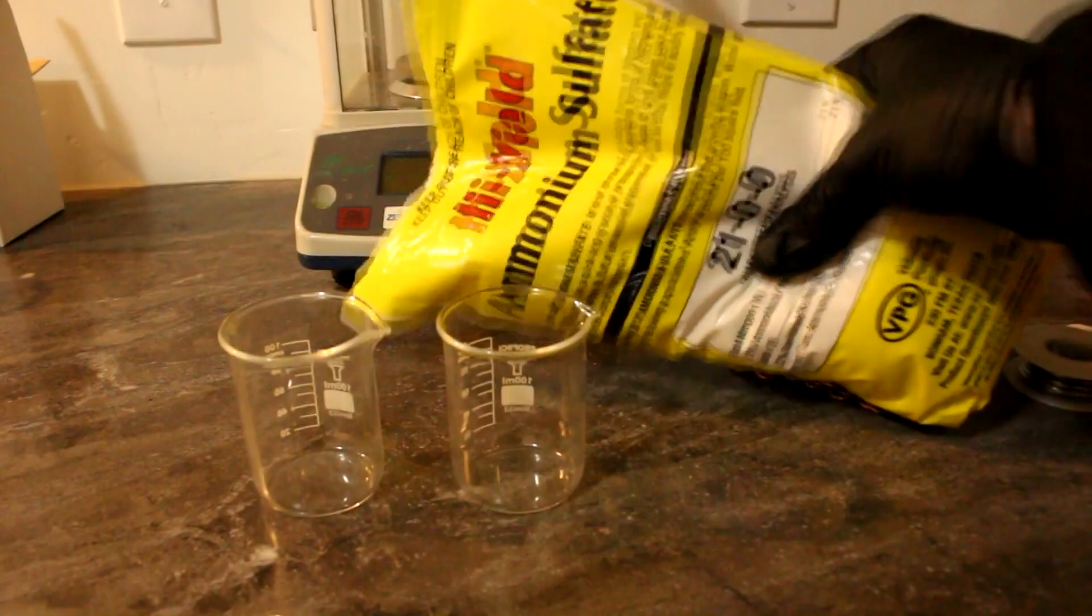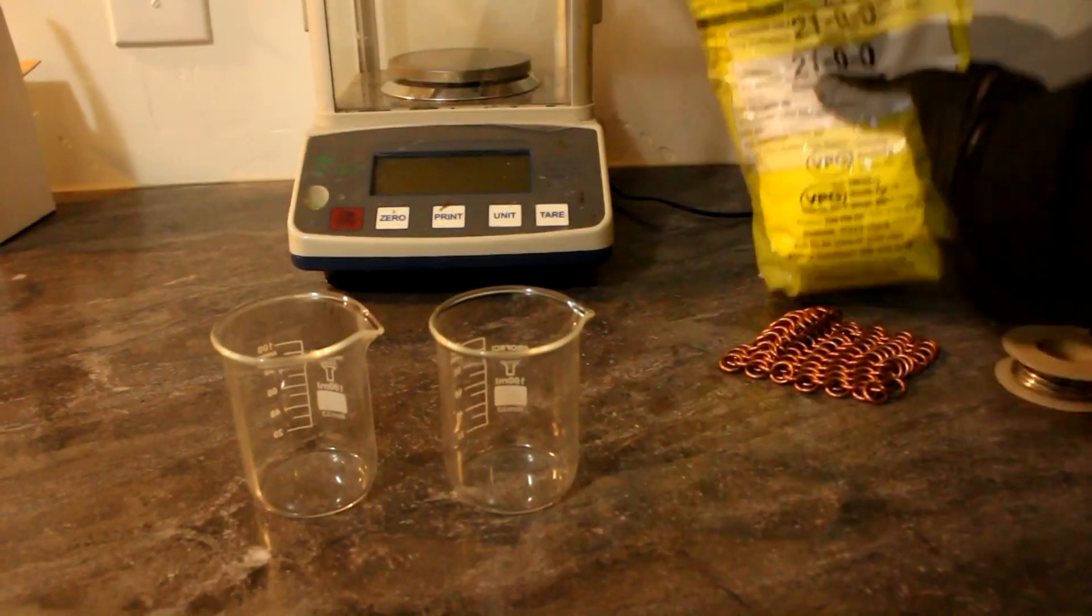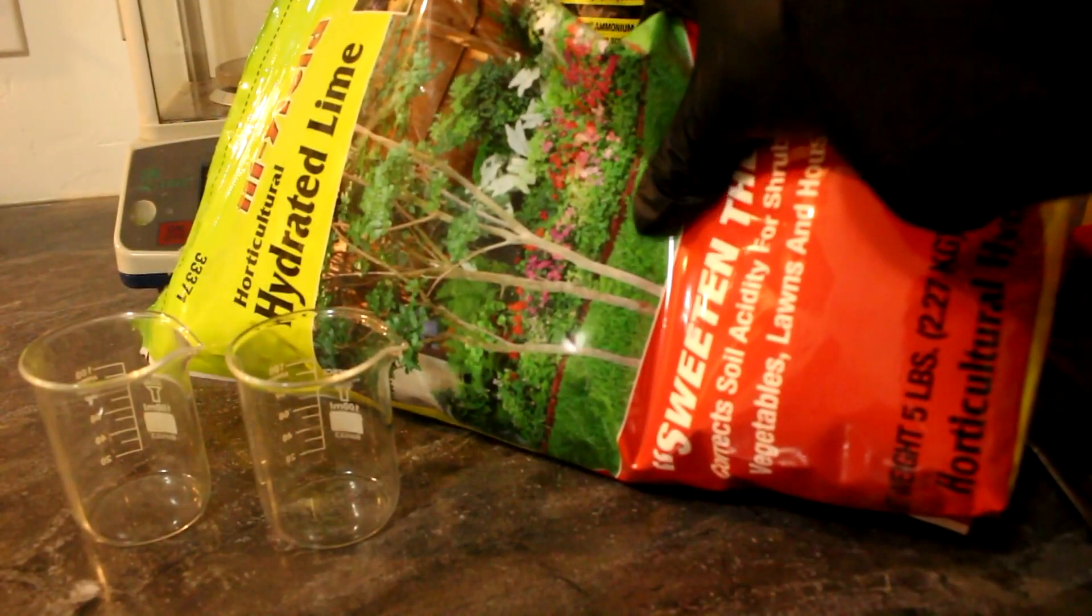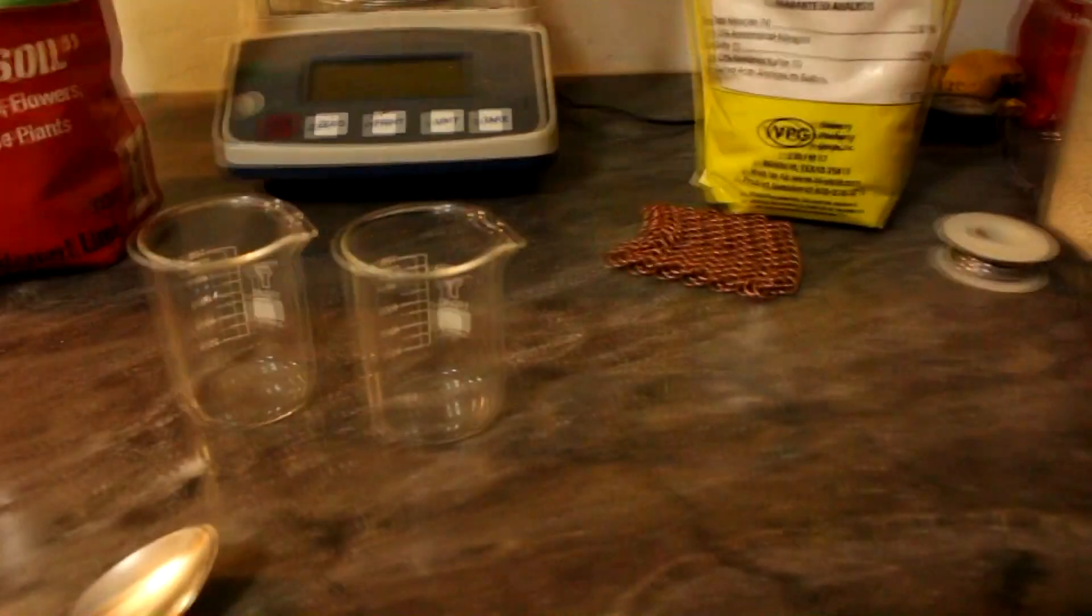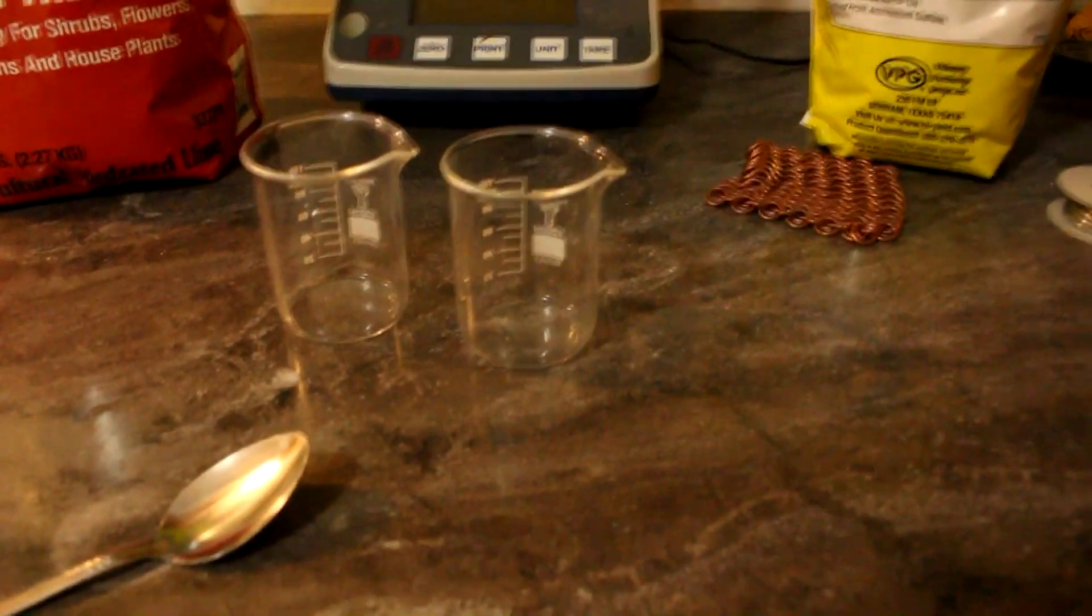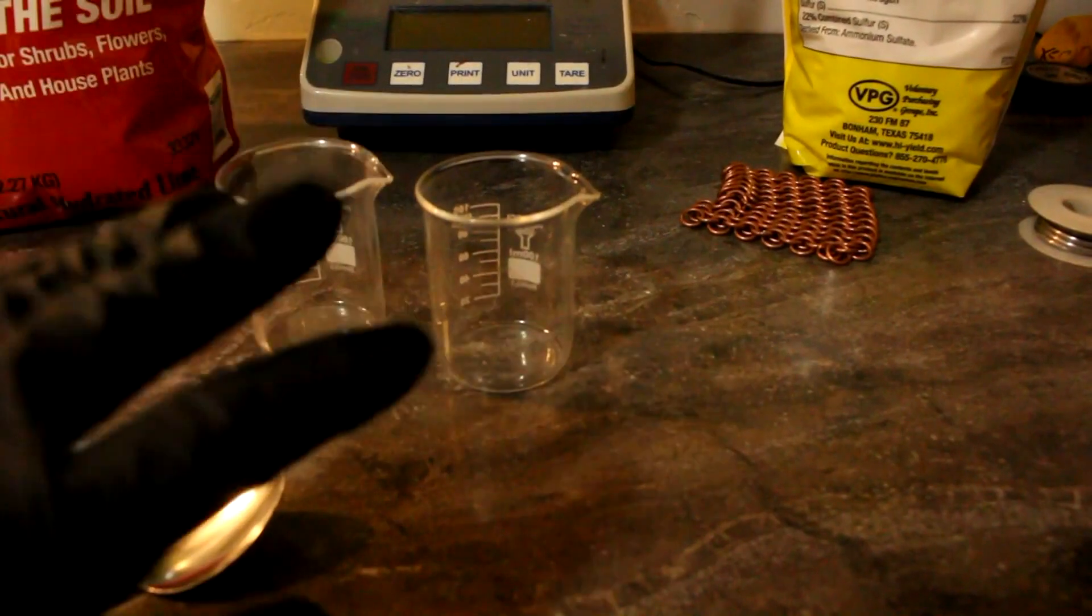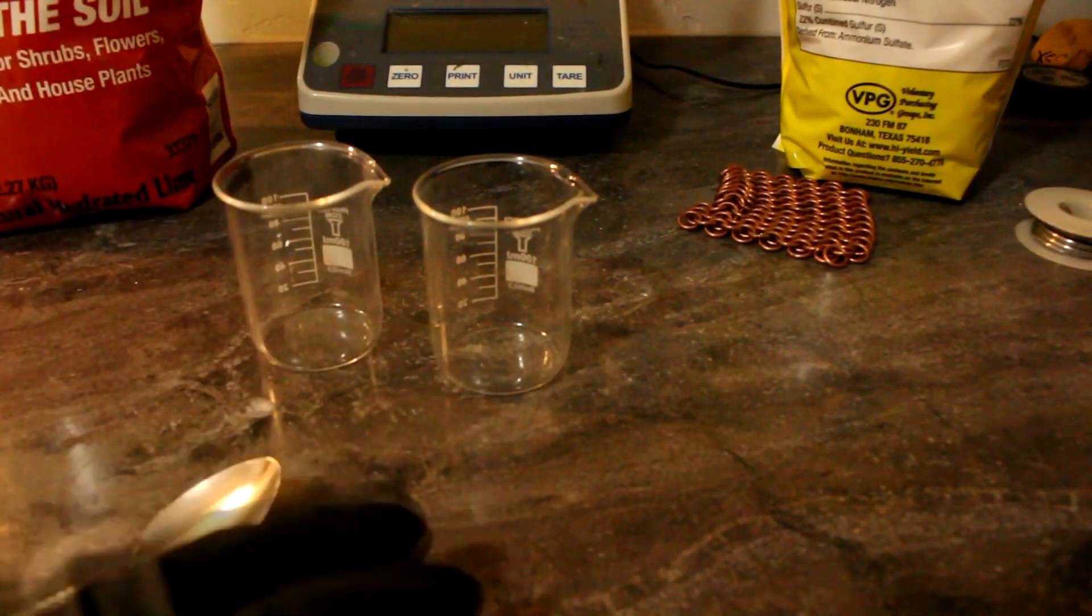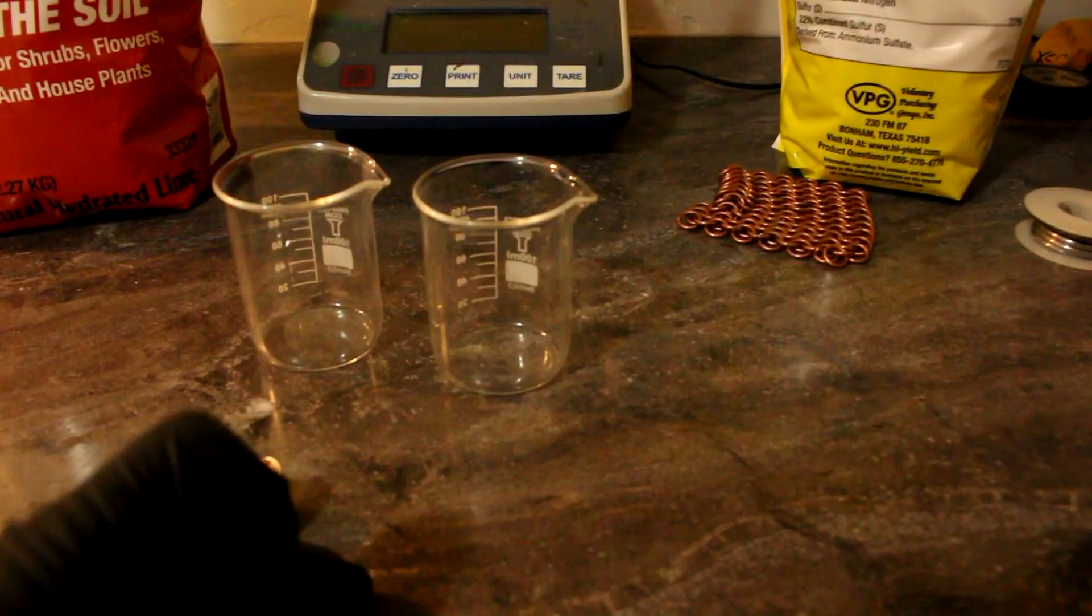So the reagents I'm going to use are ammonium sulfate as the source of ammonia and agricultural lime. This is calcium hydroxide. Now most other channels I've seen do this have used like ammonium chloride and sodium hydroxide and well you really can't buy those 50 pounds at a time from the hardware store.